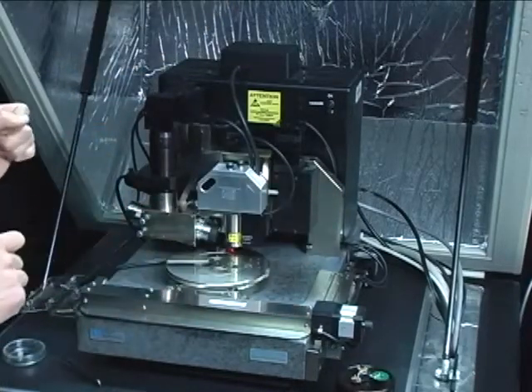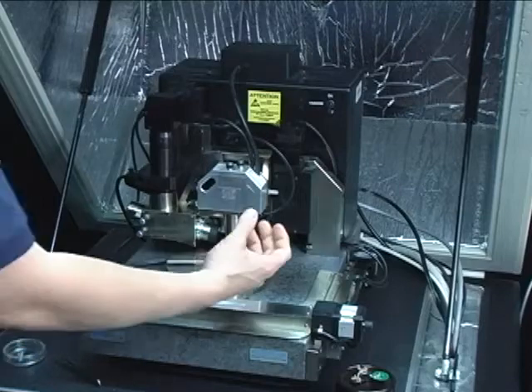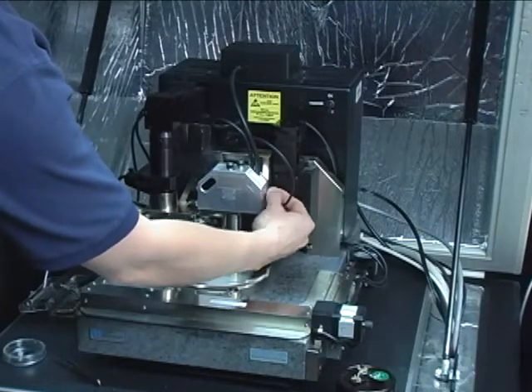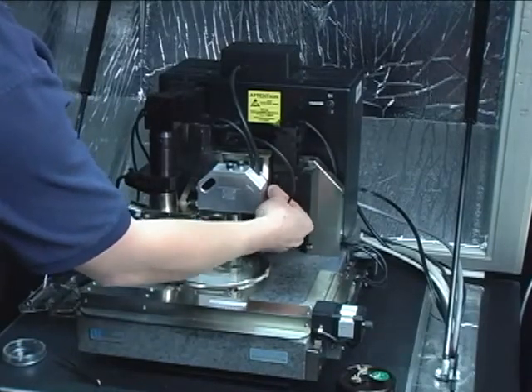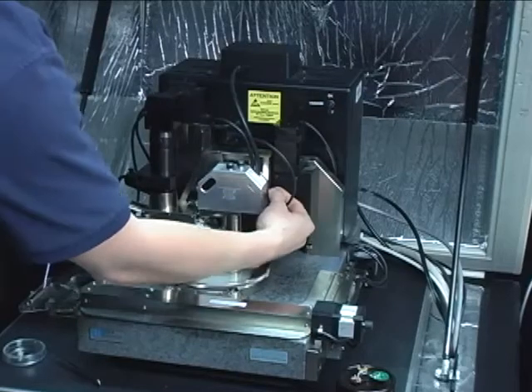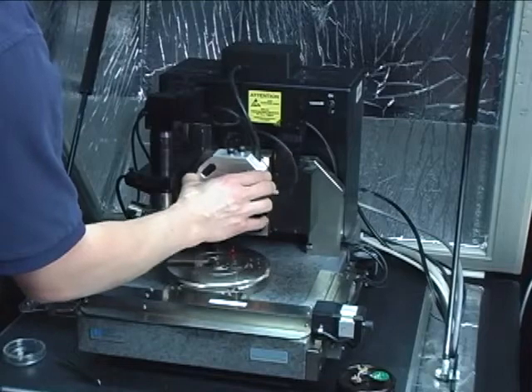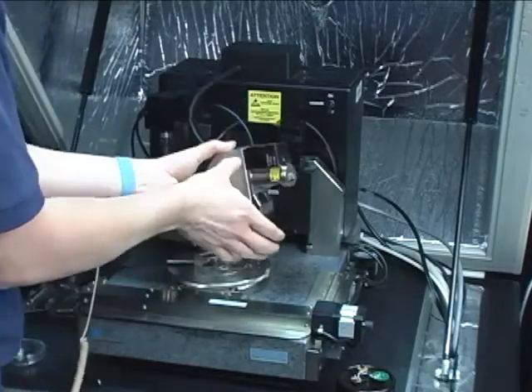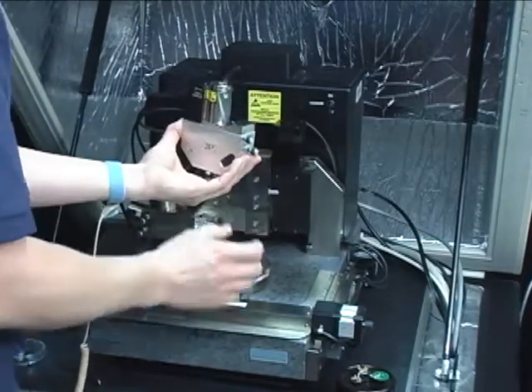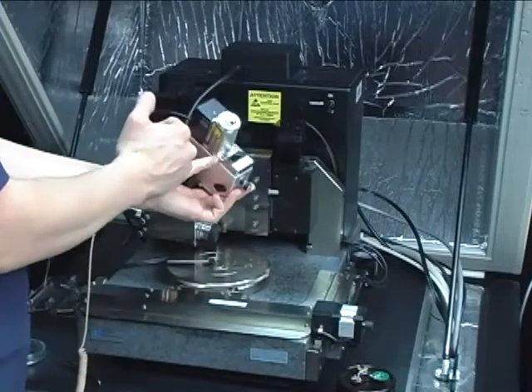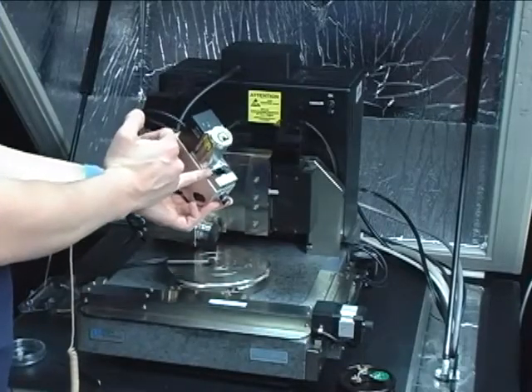Now that the conducting tip module is mounted on the scan head we can mount the cantilever mount on the scan head. So we tighten this thumb screw to release the scanner head. Gently flip it upside down being careful not to put a thumb print on the laser window.